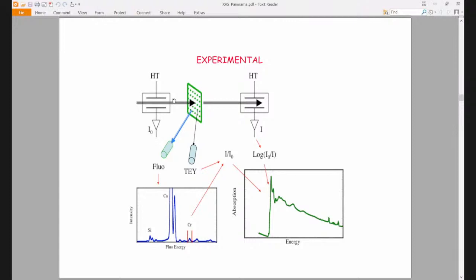But it is going to suffer a lot of scattering and lose its energy by heating phonons, making an Auger process on another atom. And at the end, you will have a lot of electrons, many electrons, thousands, even more than that, per atom which has been hit. And then all these electrons, for a reason I will show you, are going out.